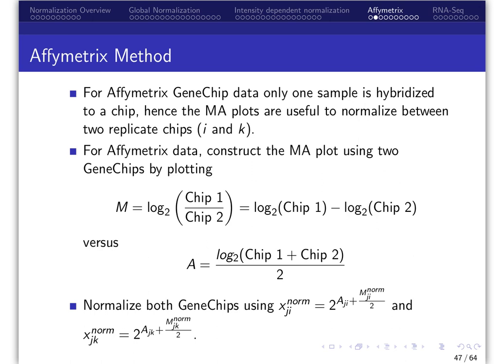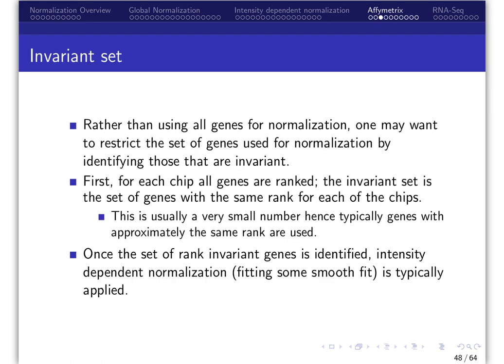To normalize more than two gene chips, the method is extended to look at all distinct pairwise combinations, recording the pairwise adjustments. The normalizations are carried out in a pairwise manner, and the adjustment for each gene chip is saved. After estimating the adjustment for all pairs to an array, the adjustments are equally weighted and applied. This will result in a set of adjustments that can be applied to the entire set of gene chips.